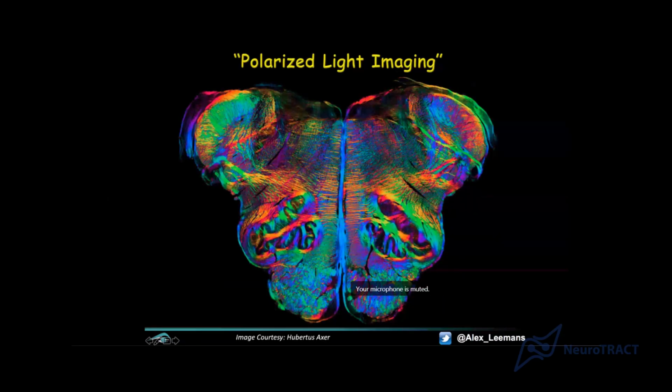Here you go. Okay, this is not a butterfly. It looks very butterfly-y. Nice colors. This is not a diffusion MRI image. This is a polarized light imaging microscopy section near the medulla oblongata, right? So near the brainstem area.